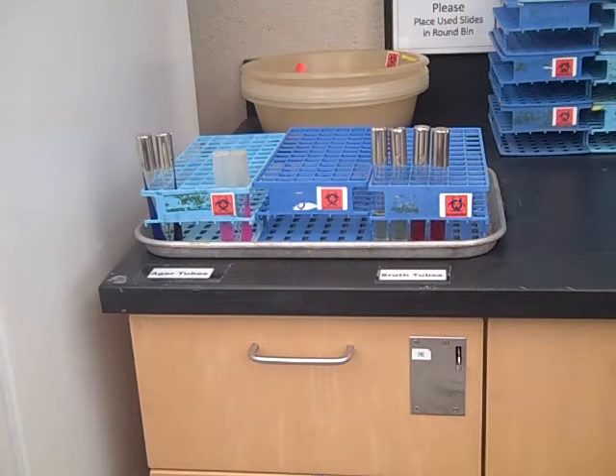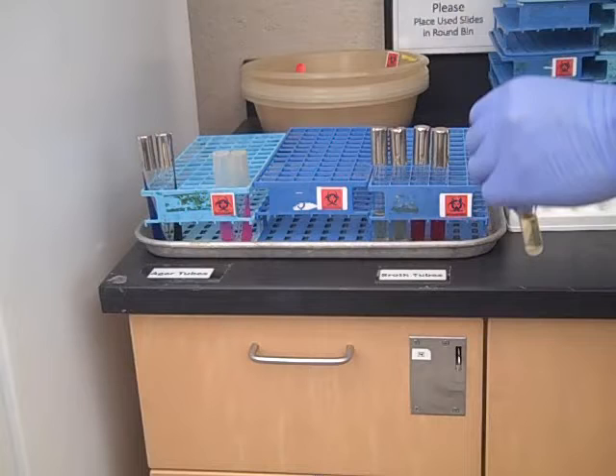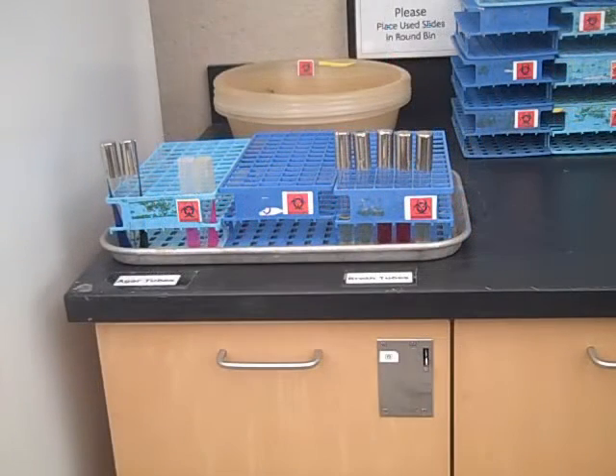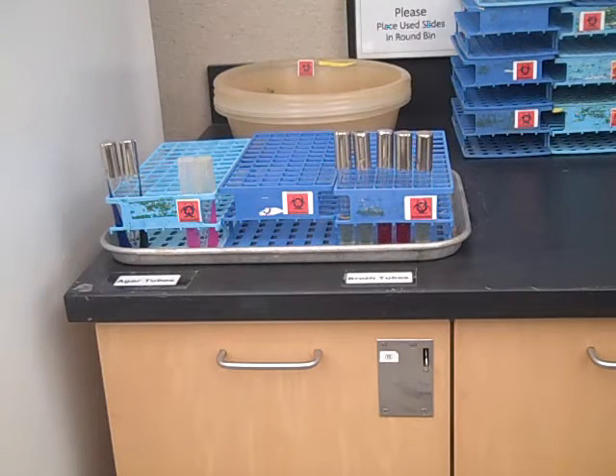When you're finished using a culture in the microbiology lab, remove any stickers, tape, or labels and place it in the discard rack at the back of the lab — please note there's a broth side and an agar side. After you're finished using a slide you prepared, place the slide in the disinfectant basin at the back of the lab.